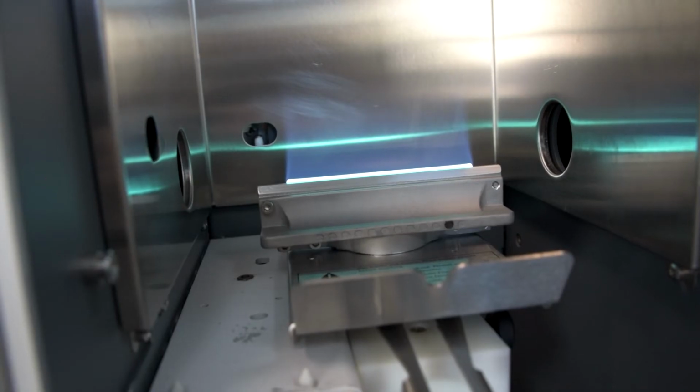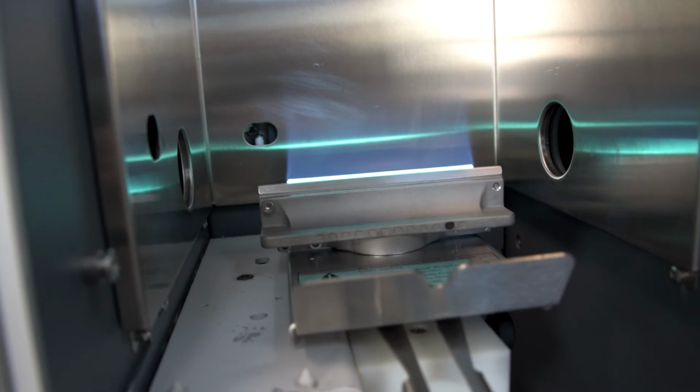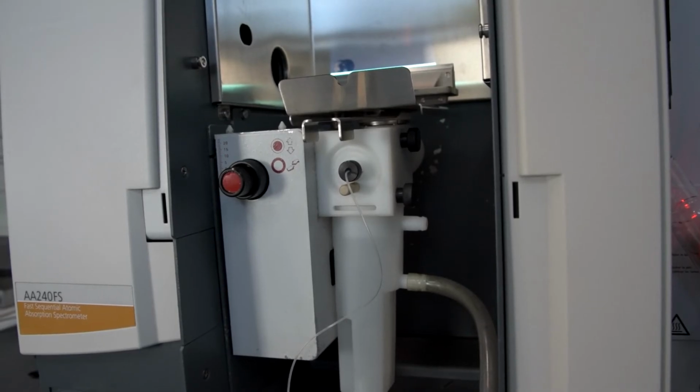The flame is where the sample is atomized and the absorption of light occurs. The flame is made by a slot burner which produces a flame which is thin. The burner can be moved backwards and forwards, up and down, and be rotated. This allows the analyst to optimize the flame temperature, level of oxidation, and path length of the flame respectively.